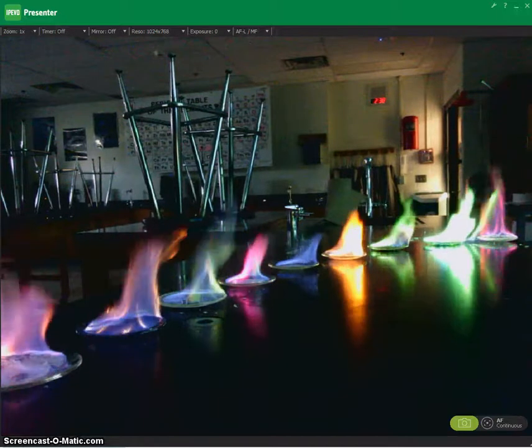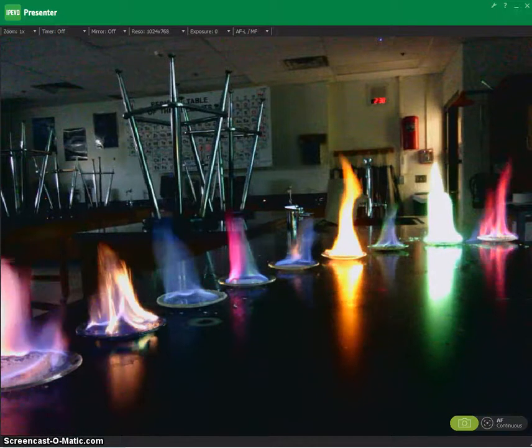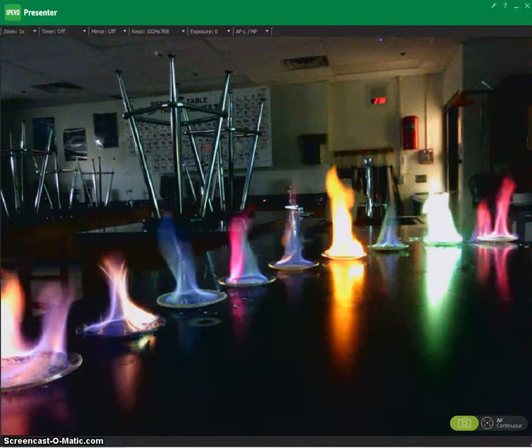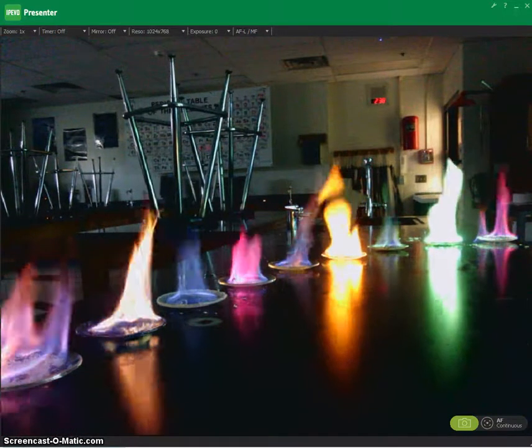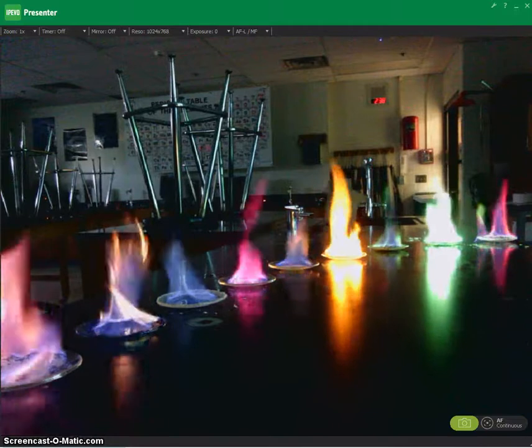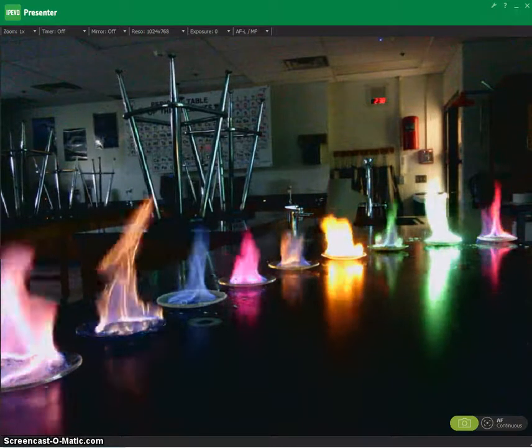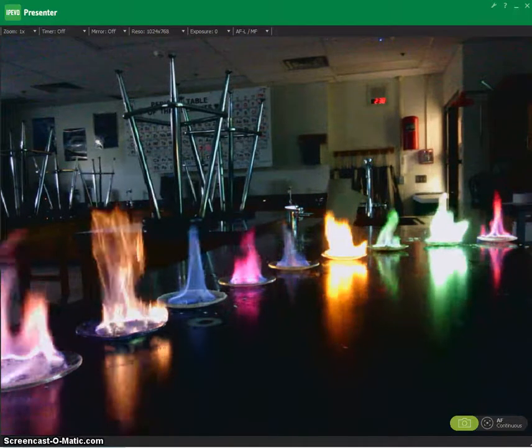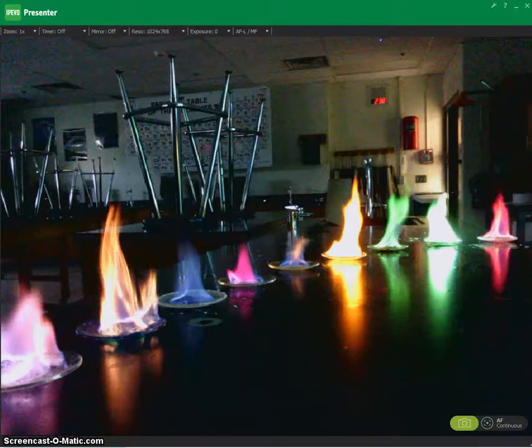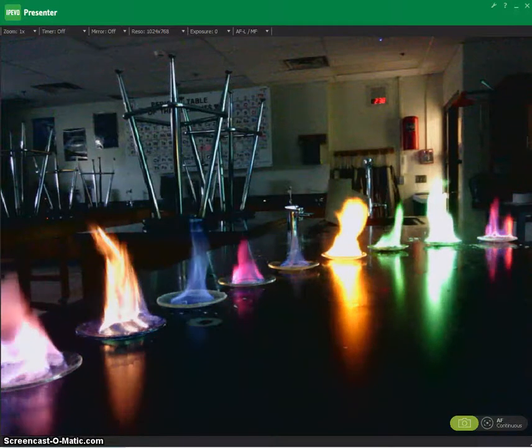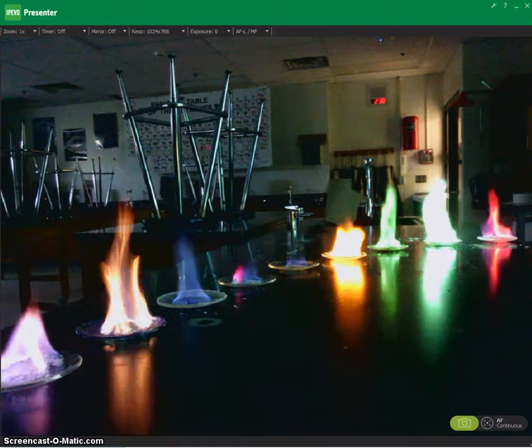The first one is potassium chloride on the left, then cobalt chloride, then boric acid, lithium chloride, magnesium chloride, sodium chloride, copper 1 chloride, copper 2 chloride, and the last one is strontium chloride. So this is an example of nine different emission spectra.